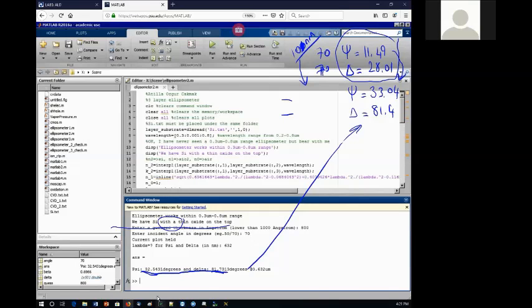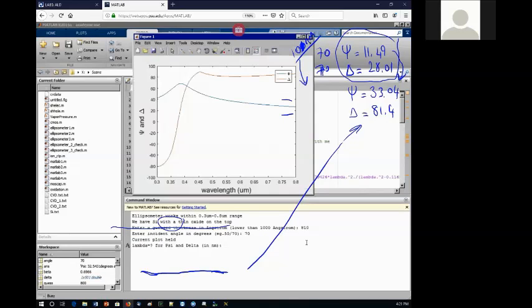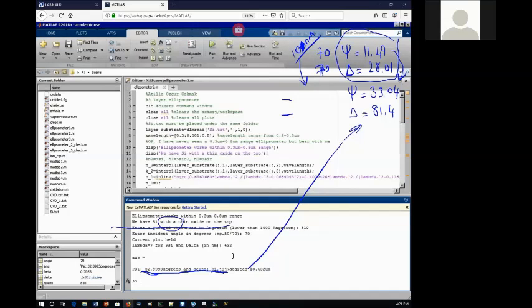So I think it was 810. So I'm going to say 810 now, and 70 degrees again, and 632. Yeah, almost. This is almost the right number. Or I think it was 814 or so, something like that. So if we had time, we would find it 100%.